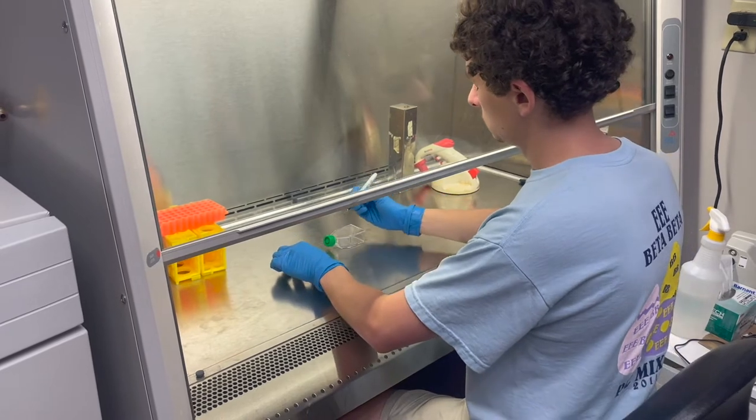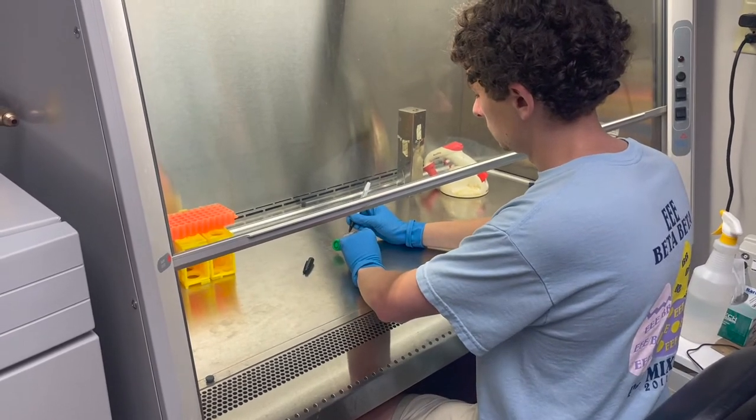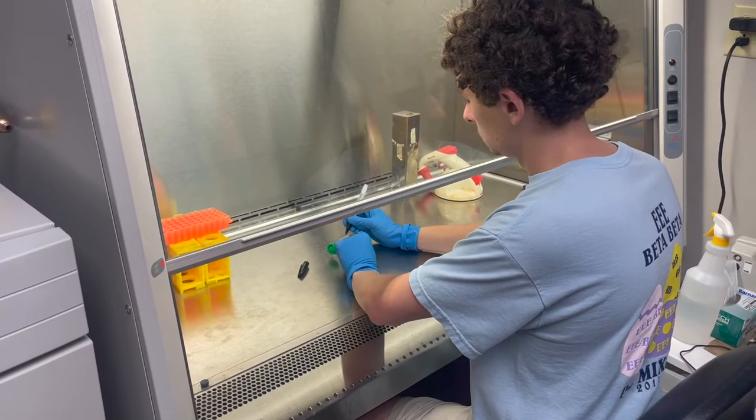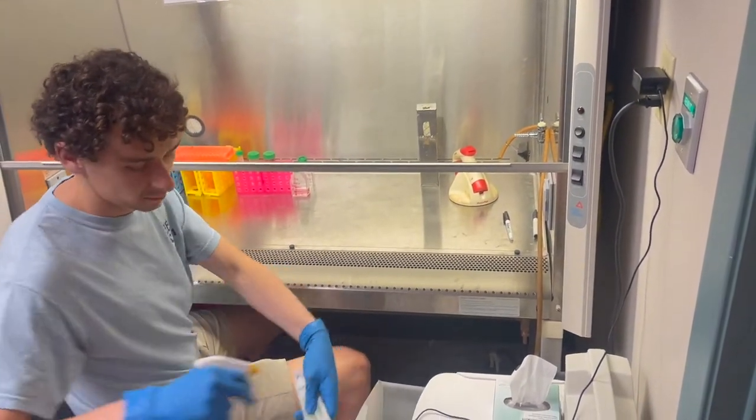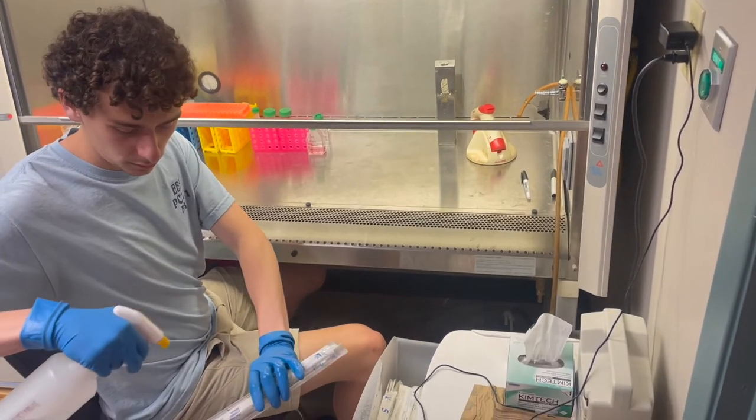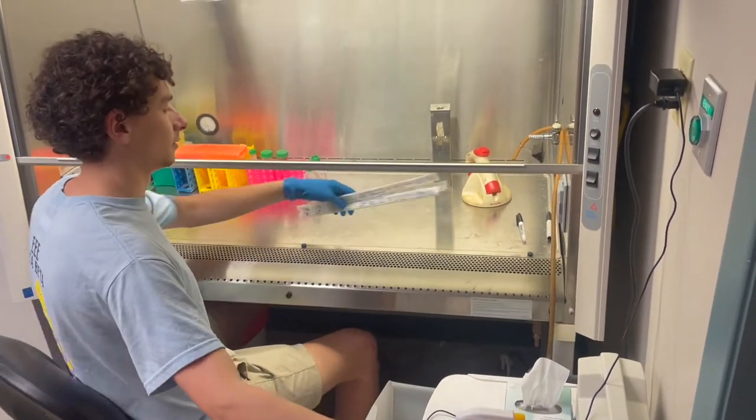Label a new flask with your initials, cell line, date, and passage number. Remember to spray items with alcohol before placing them inside the hood. See the cell culture best practices video for more detailed instructions on proper hood technique.